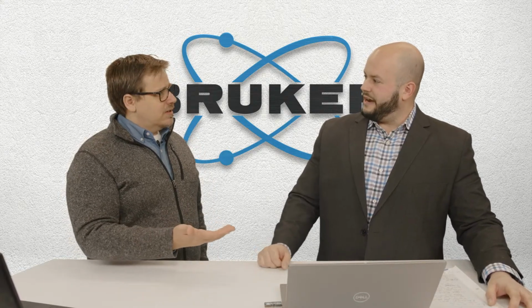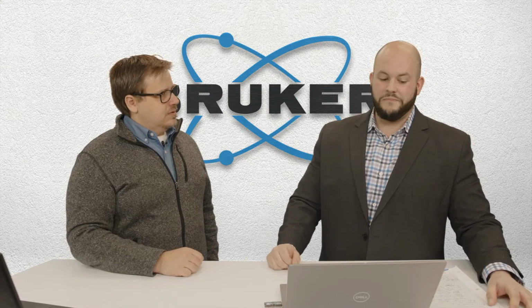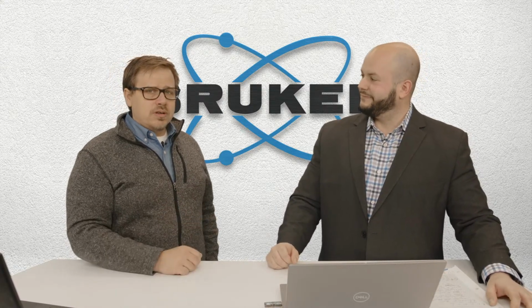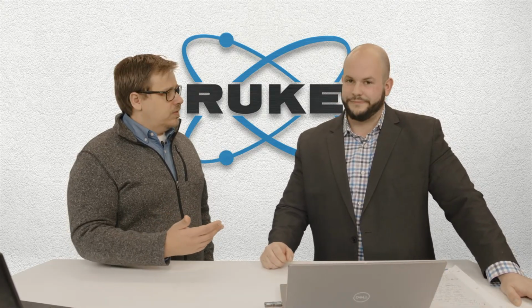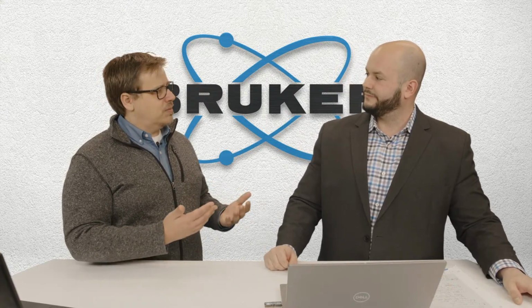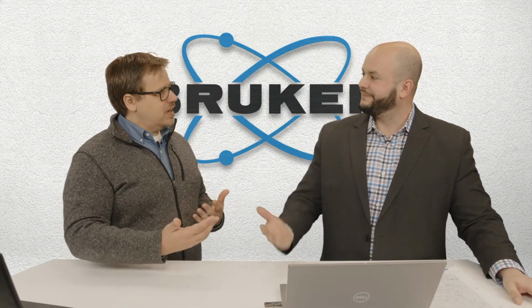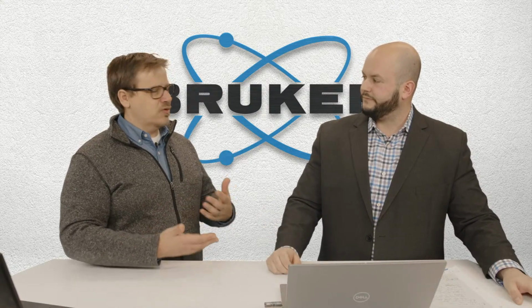I think ellipsometry is another one that uses light also to extract thickness. Yeah, that's a big one in terms of the semiconductor space. Now, the big difference, I think, between ellipsometry and XRR, though, is it's fundamental. XRR is. Whereas ellipsometry, yeah, there are some models out there, but generally what people do is it's more of a correlation.